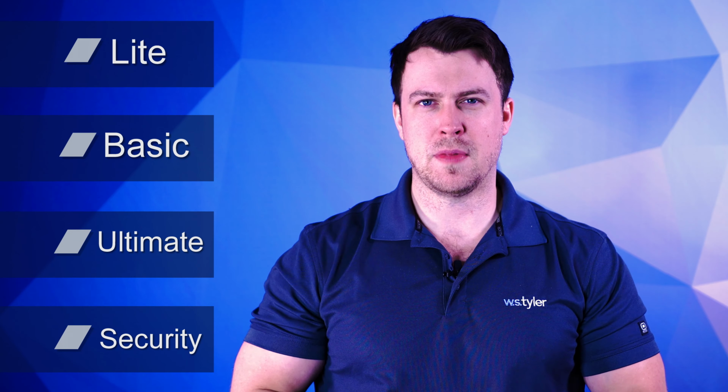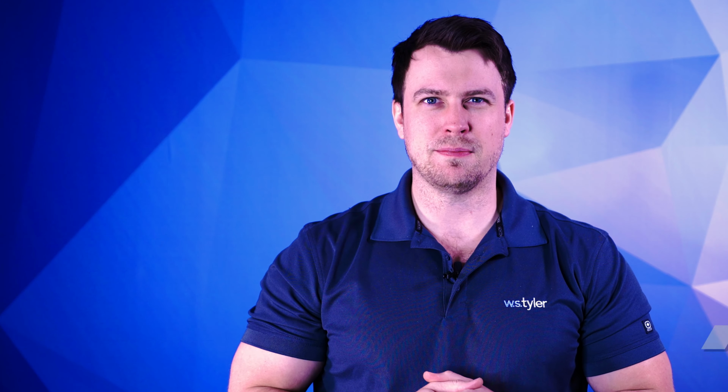The E200LS Alpine Air Jet Sieve has 4 different software levels that you can choose from: the Lite, Basic, Ultimate, and Security, each one having unique properties to fit your specific needs.